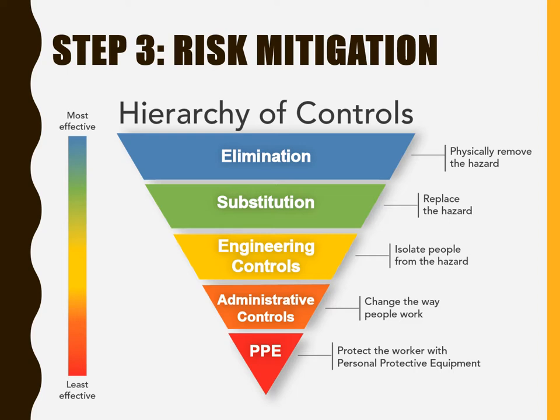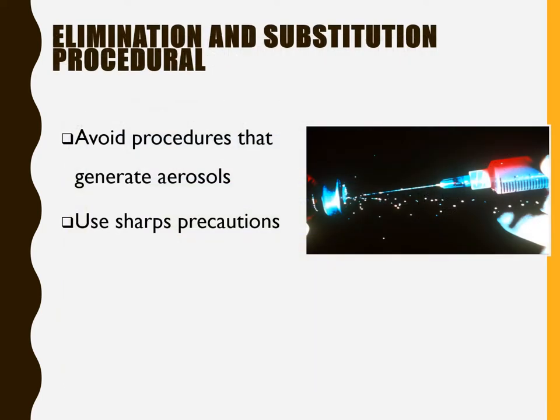Step 3 of risk assessment is risk mitigation — after identification of hazards and their evaluation. Mitigation means reducing the severity. The hierarchy of controls listed from most effective to least are: first, elimination — physically removing the hazard; next, substitution — replacing the hazard with a non-hazardous substitute; third, engineering controls — structurally separating the hazard from people; administrative controls — changing the way of working; and last, personal protective equipment. For elimination and substitution, avoid procedures that generate aerosols as much as possible and use sharps precautions.